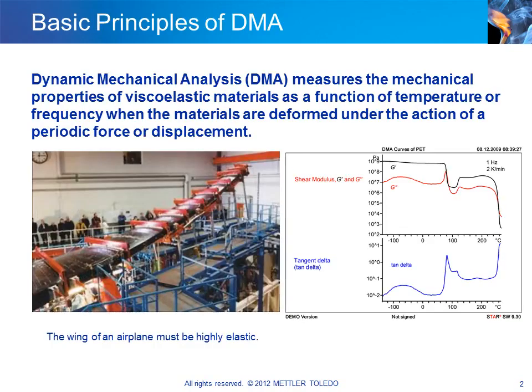The picture on the left of the slide shows the wing of an airplane undergoing a quality test. The wing is subjected to strong deformational stresses such as occur at takeoff and landing. The red sensors record the measurement data. However, large-scale tests of this nature are very time-consuming and expensive.